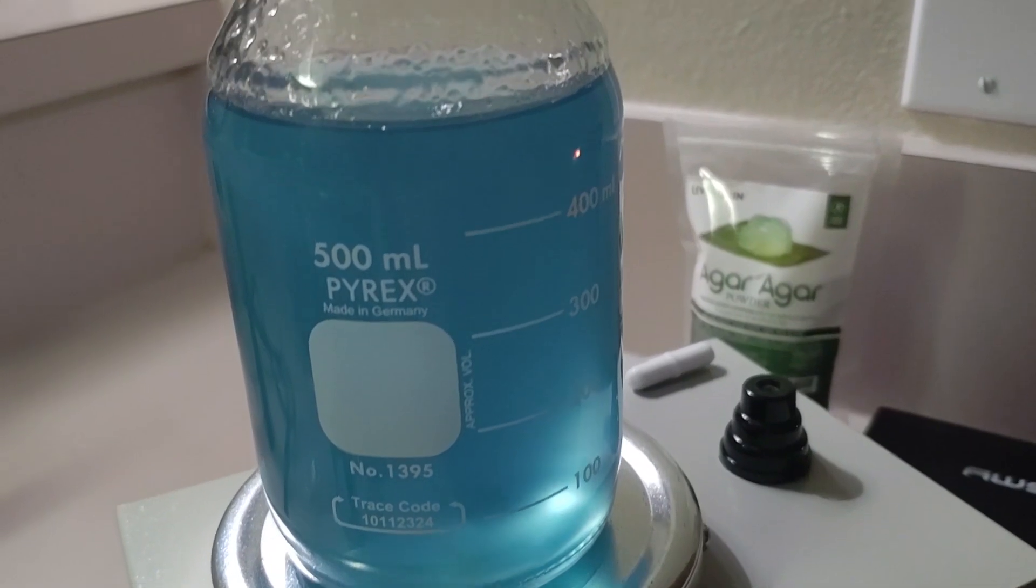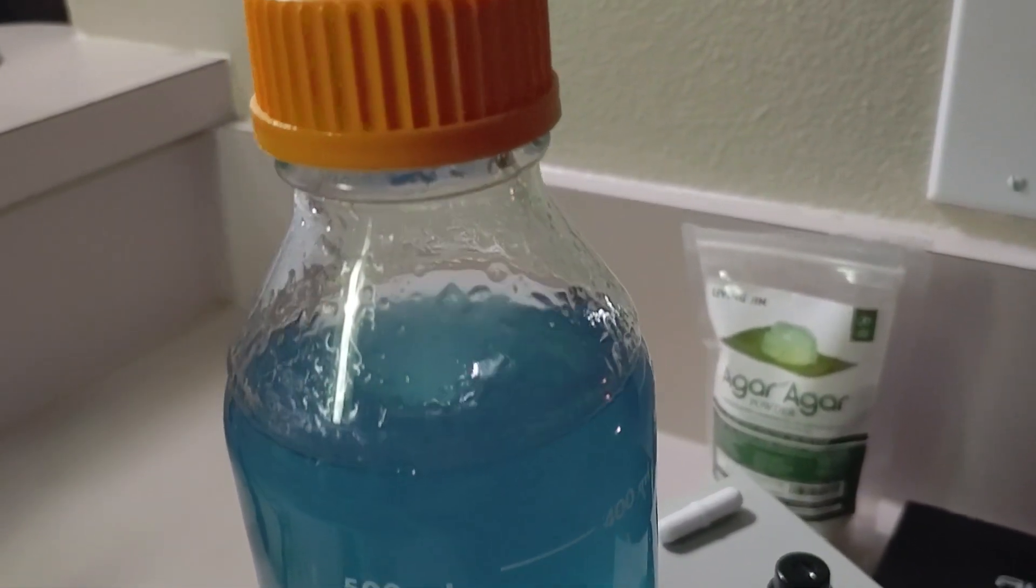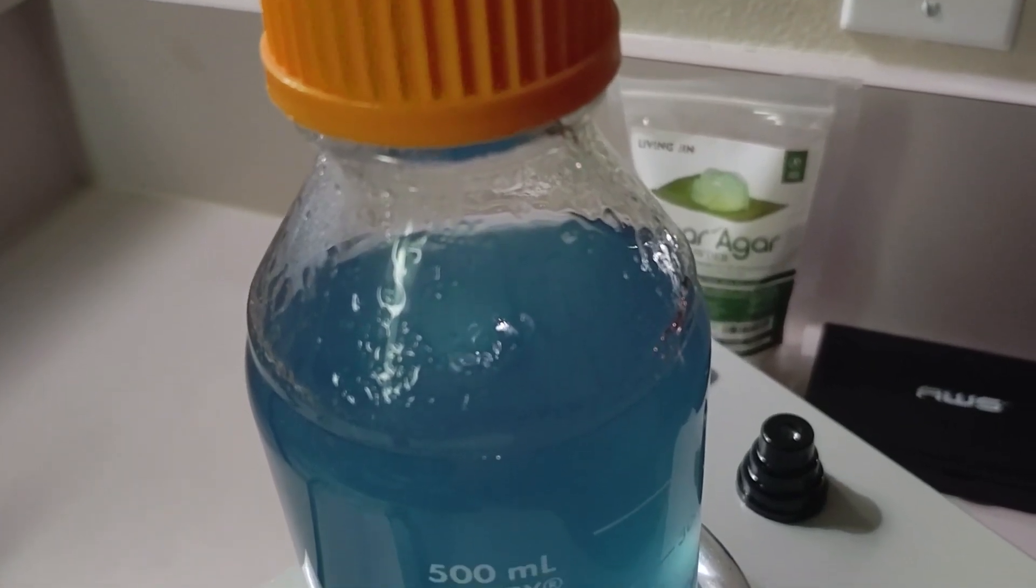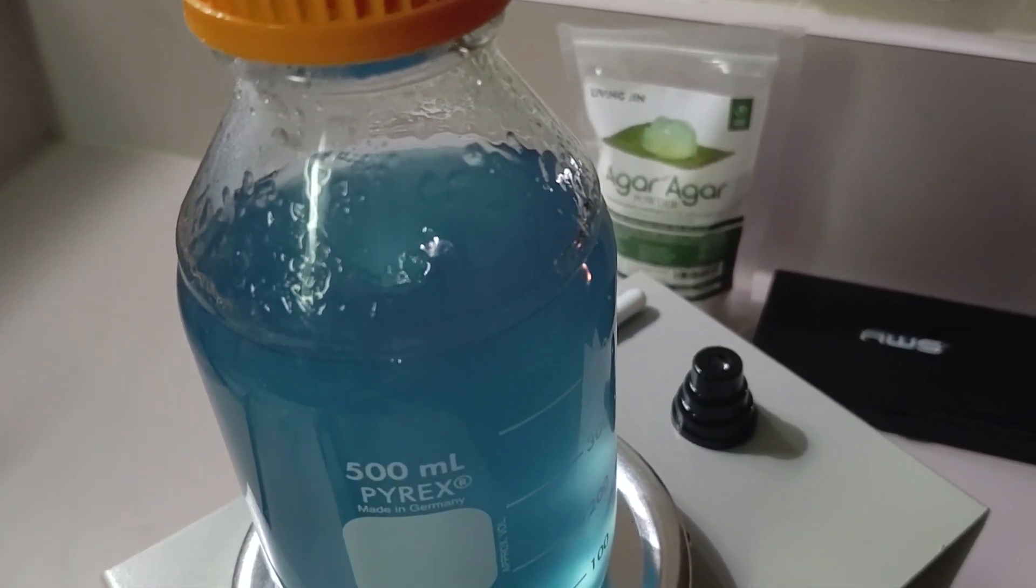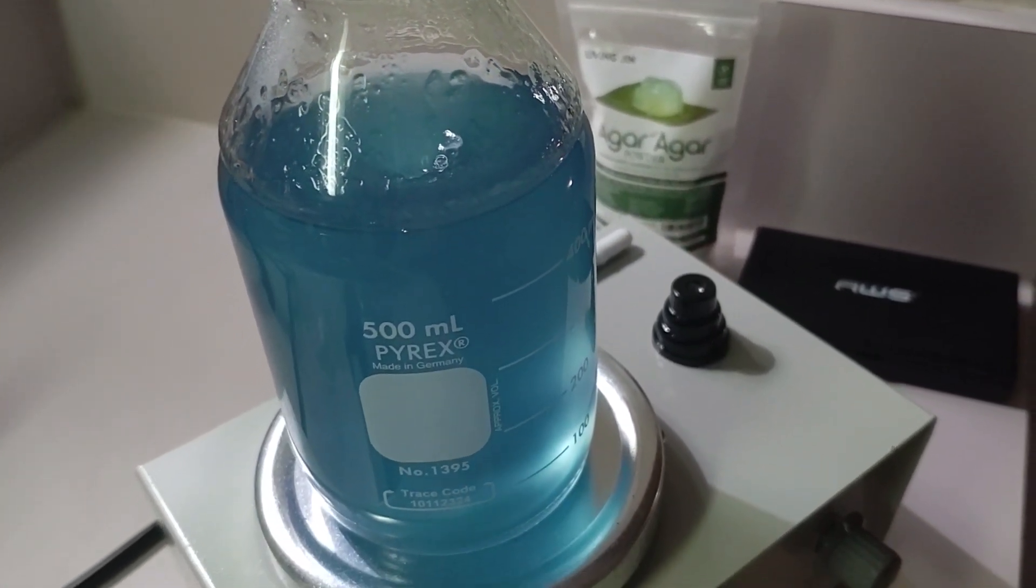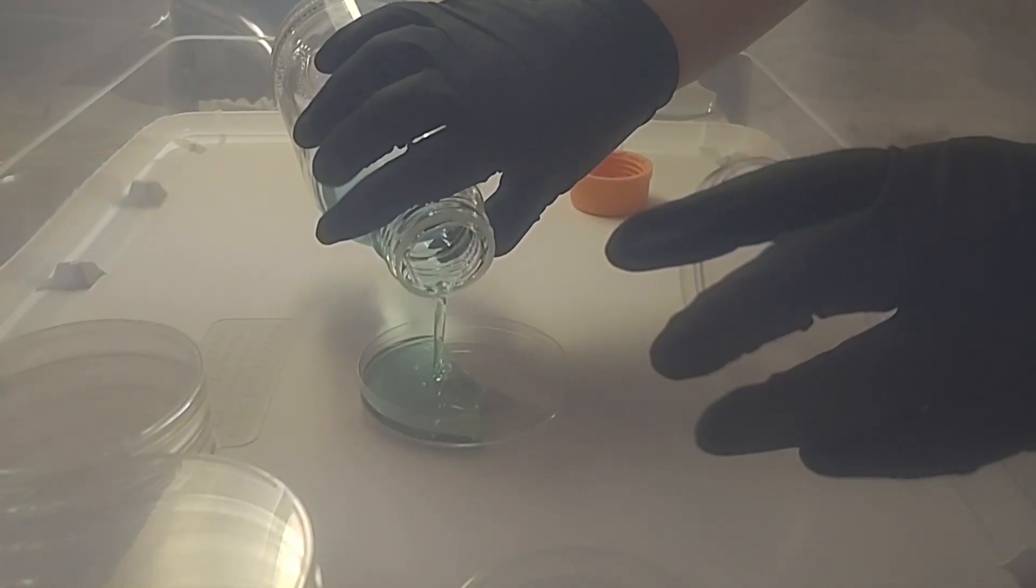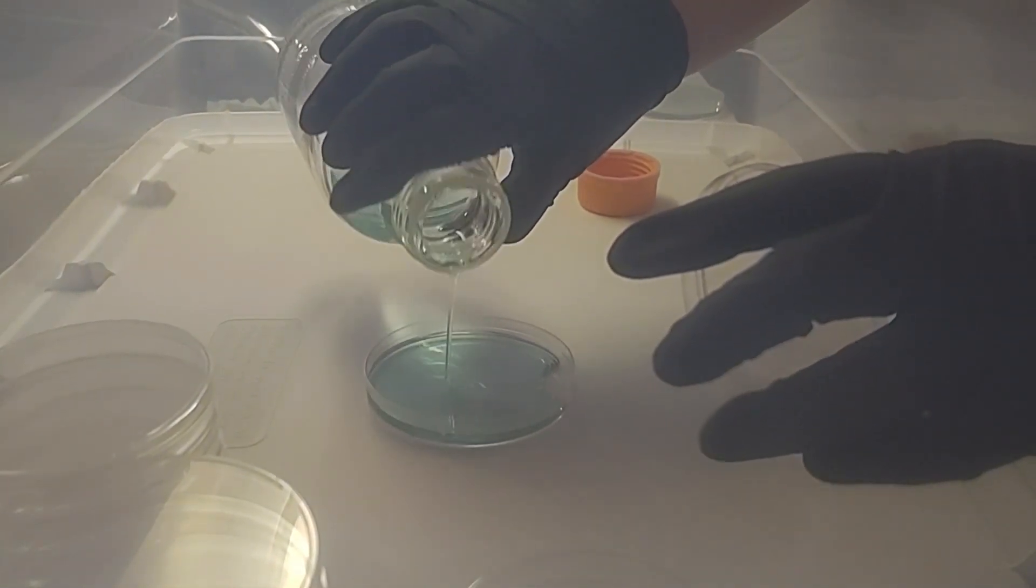There are dozens of recipes for agar, however, when you break it down to the basics it's all about nutrition and sugar. We are not talking about cane sugar, we are specifically talking about dextrose which is in most MEA blends and honey. Some use popcorn grain to create a corn syrup water known as grain water.